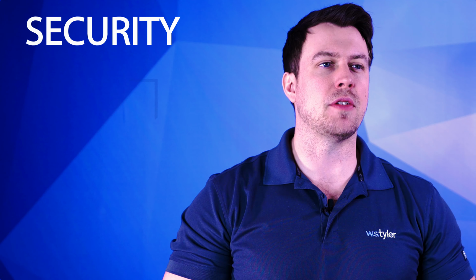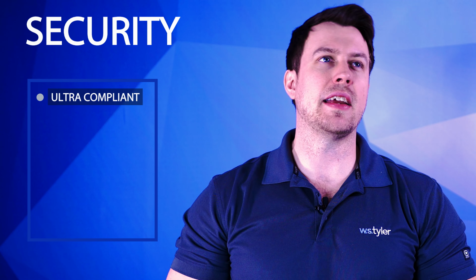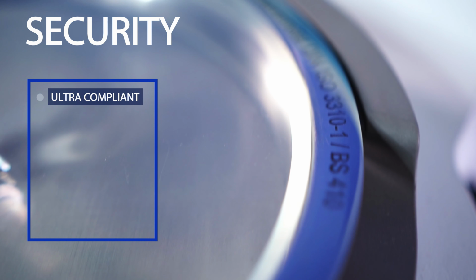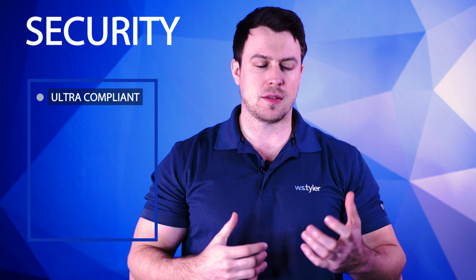The last level of software is Security, and this is only for very specific customers who have very specific needs. For example, if you need to be CFR 21 Part 11 compliant. Now that would apply to FDA regulated foods, that would apply to pharmaceutical materials. The Security is much like the Ultimate in terms of its functionality.